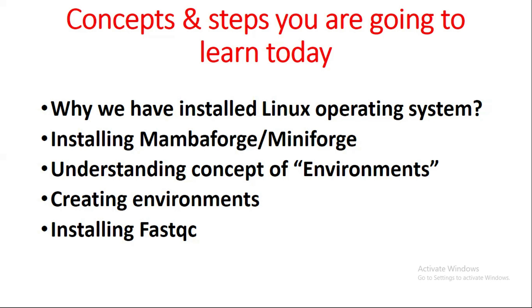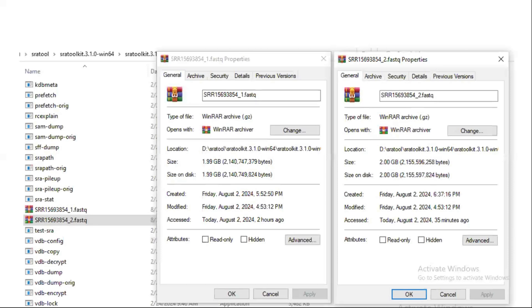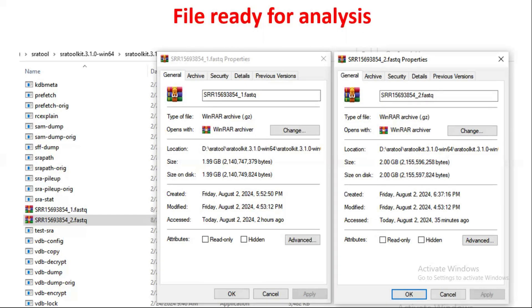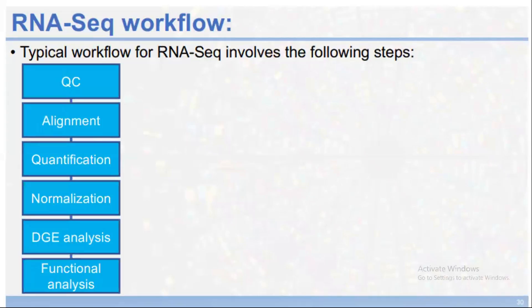In the previous video, we generated and downloaded the first few files. If you want to learn RNA sequencing in more detail and from the very beginning, start from the first video. These downloaded files are what we will be analyzing, and for that analysis we will be working with the Linux operating system.